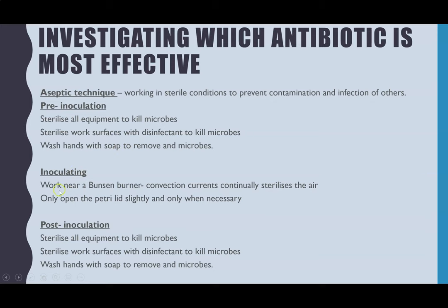During inoculation you should work near the Bunsen burner the entire time. The flame creates convection currents that draw air upward; as the air passes through the flame it kills any microbes in the air, giving you a constantly sterilised airflow. Also, with the Petri dish lid, only open it when necessary and only slightly at an angle to reduce the chance of any microbes landing on the agar.